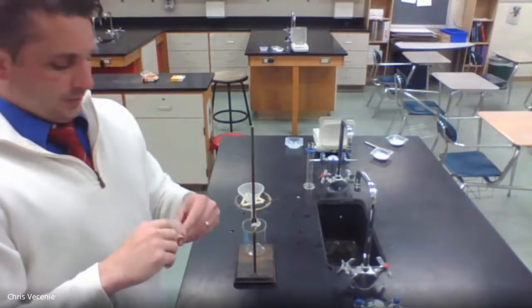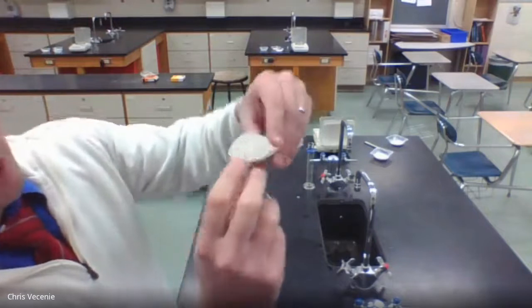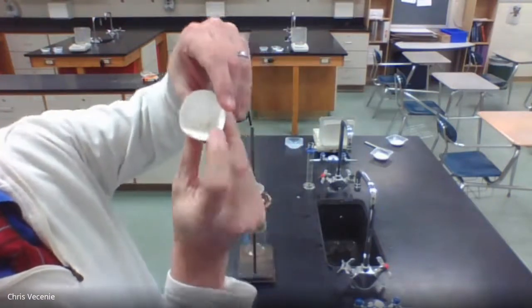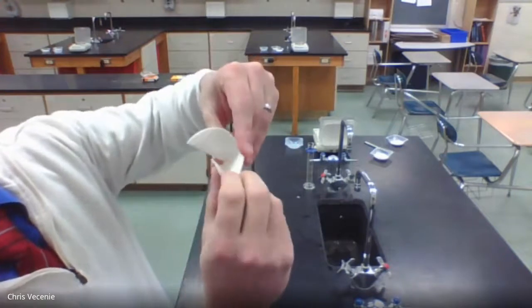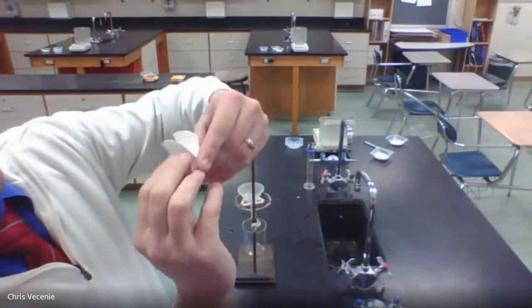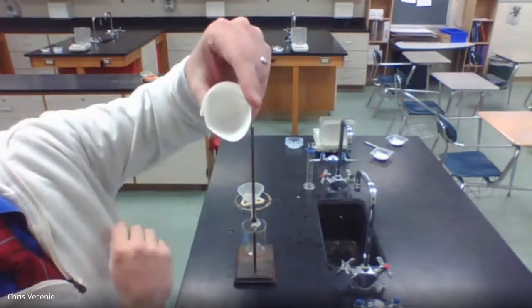Now what I'm going to do is take that filter paper, and there's a couple filtering windows. There's the top window, that's a good filtering window. Middle window, that's a bad filtering window because it's got that big open space over here. And your bottom window, that's another good filtering window.